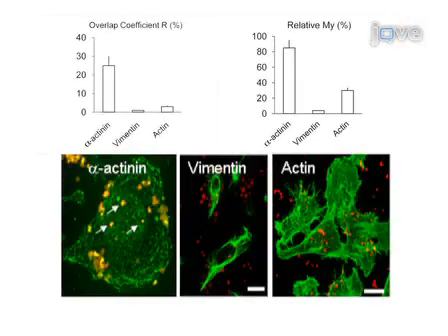Results are obtained that show meningococci expressing OPC, an outer membrane protein, can specifically interact with intracellular α-actinin, based on confocal microscopic visualization and by quantitative co-localization analysis.